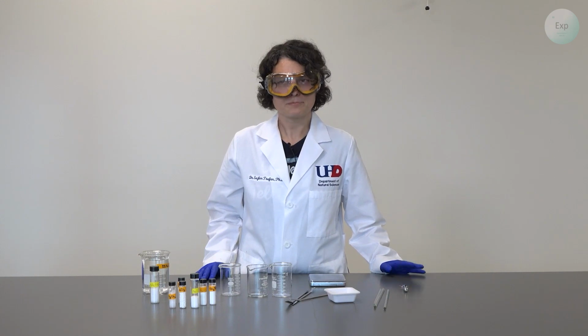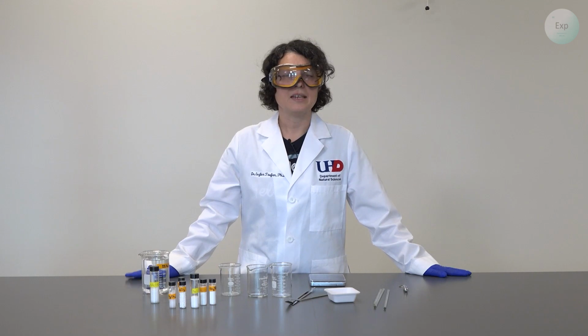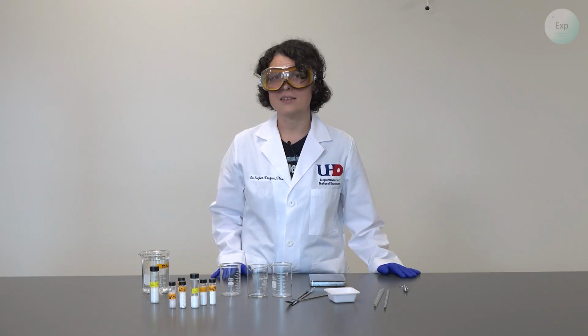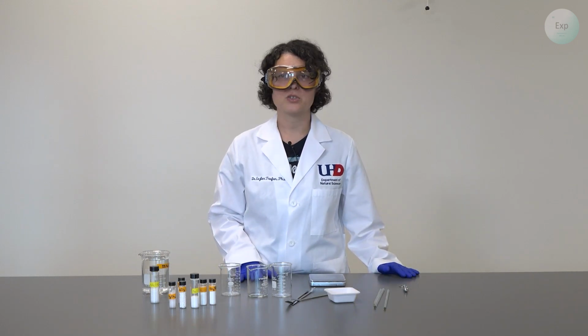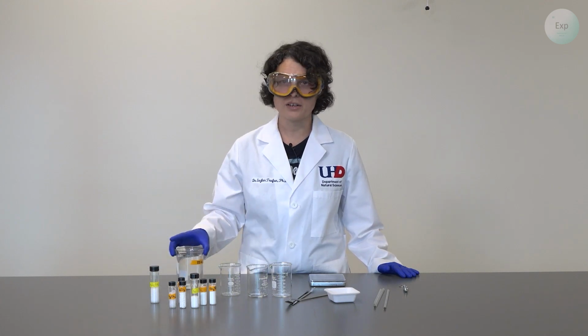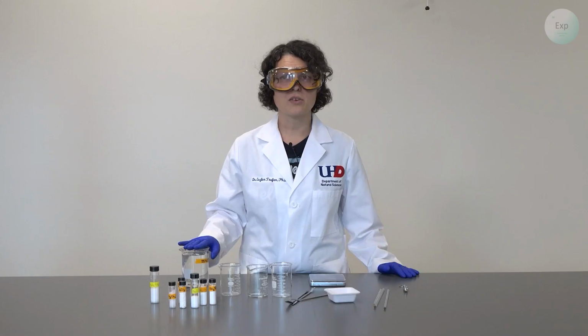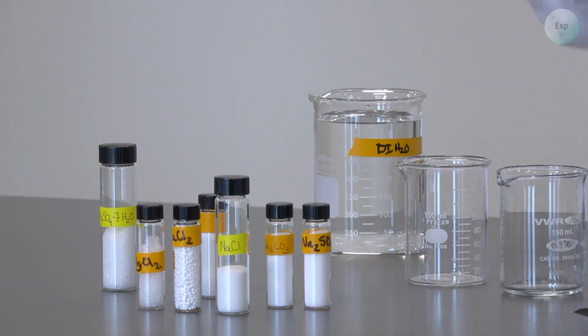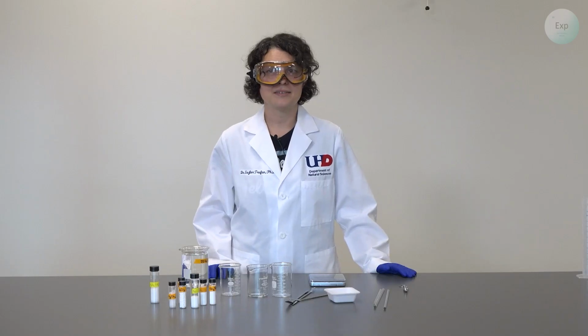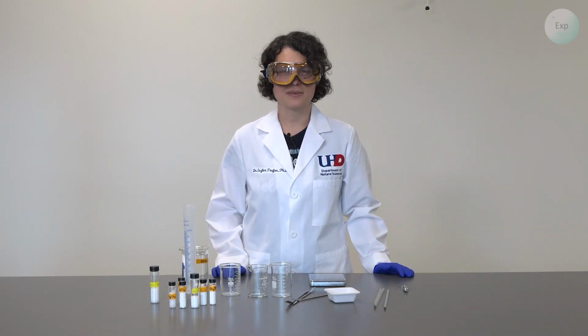solubility of chlorides. In General Chemistry 1, we talk about solubility in absolute terms. Is a material soluble or insoluble? And the rule by which we determine those is 100 milliliters of water or 100 grams of water able to dissolve at least 1 gram of the solid? If it is, we call it soluble. If it isn't, we call it insoluble. And that brings us to the last piece of equipment that we need, a 100 milliliter graduated cylinder.